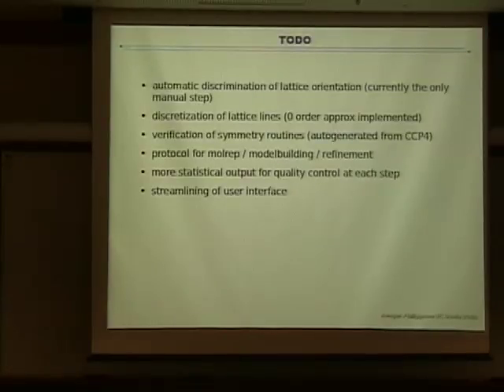But in our square unit cells, there's no way to distinguish between the two. We've tried for about 2 months to find some heuristic automatic discrimination. Couldn't do it, so now you really have to do it manually. You have to say, okay, this one is AB and this one is BA. It's very unfortunate.